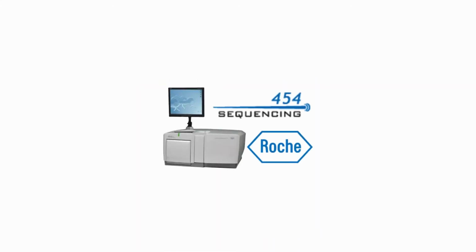454 has been a leader in the NGS technologies for less than a decade, and despite putting out longer and longer sequences, at some point the short reads were as long as 800 base pairs, the high price was making it vulnerable to competition. At this point, 454 has been discontinued by the Roche company and other technologies are taking the lead.